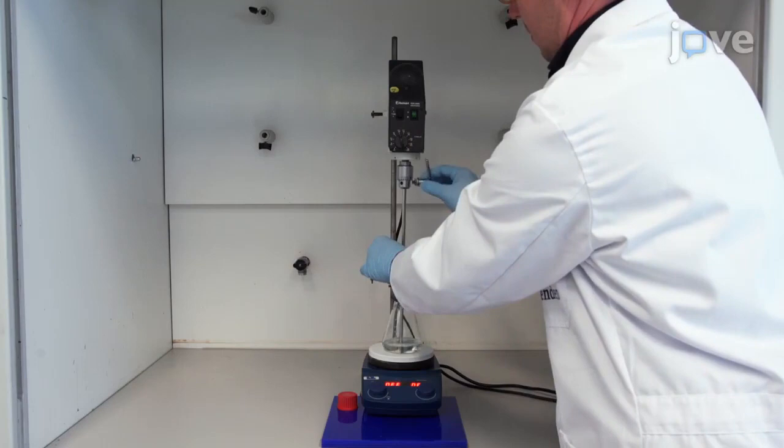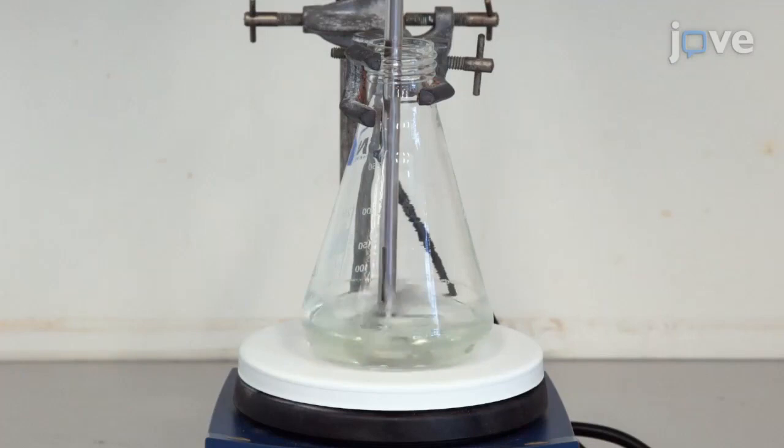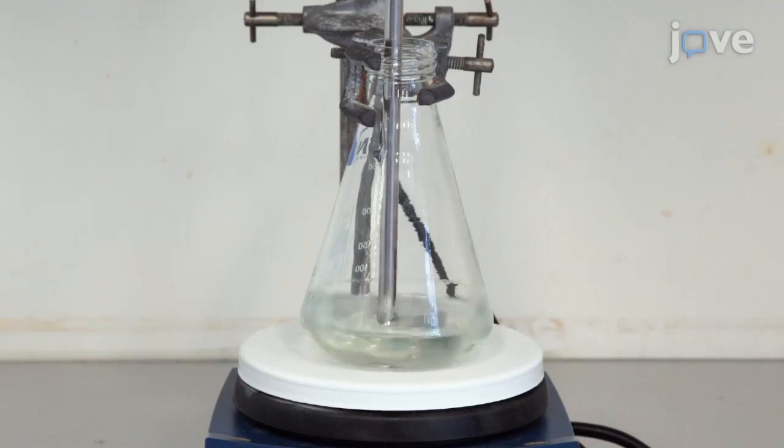Equip the Erlenmeyer flask with a mechanical stirrer and stir the mixture at 200 rpm for 5 minutes at room temperature in order to dissolve the TPO and BBOT in the acrylate monomer.